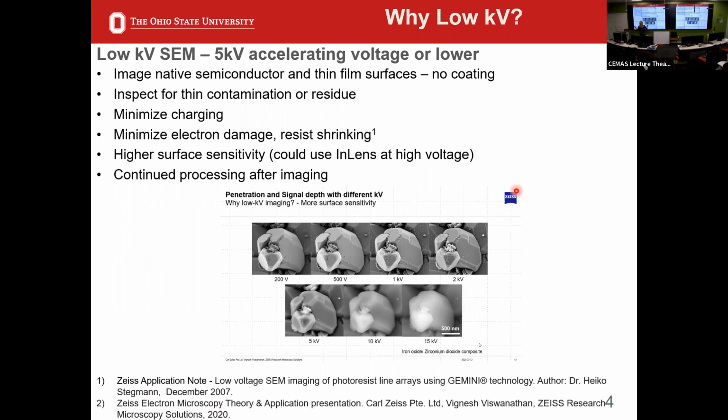So in the semiconductor production facilities, they'll have CD, critical dimension SEMs, CD SEMs. And this is one of the major issues for them, right? They need to make sure that when they're taking their measurements, they're not actually altering the measurement while they're doing that. So it's something that's really critical. We don't have a CD SEM, just the nature of our lab. But in the semiconductor manufacturing world, that's something you'll hear a lot about.